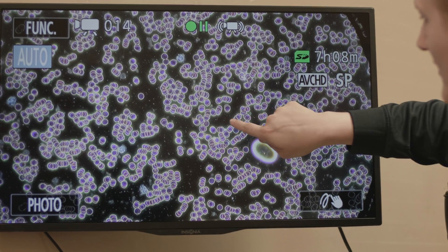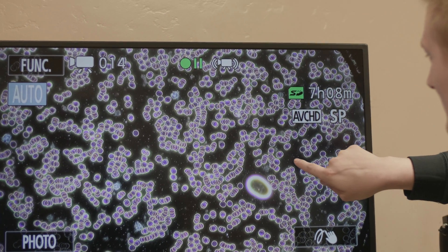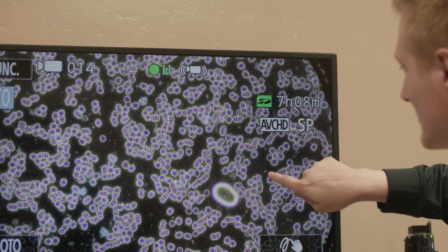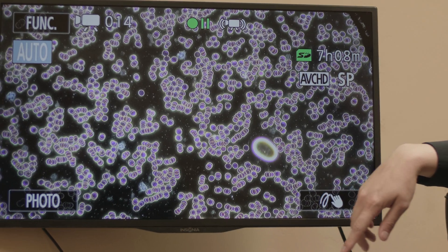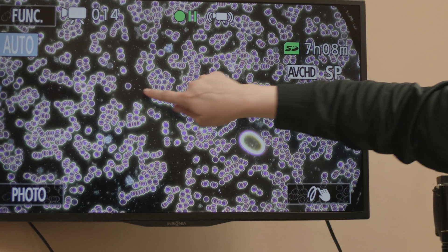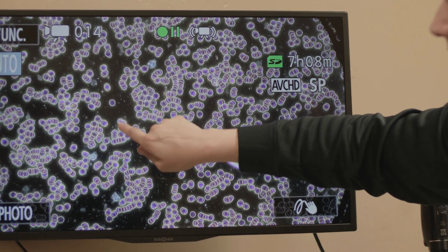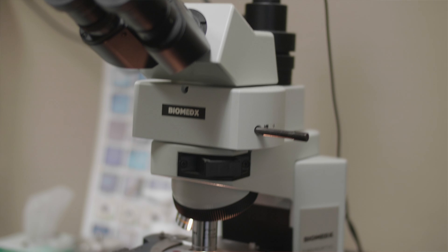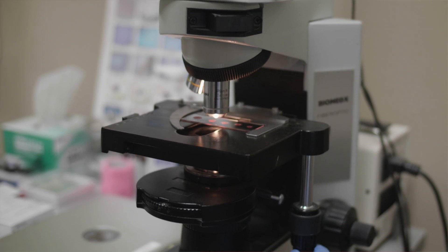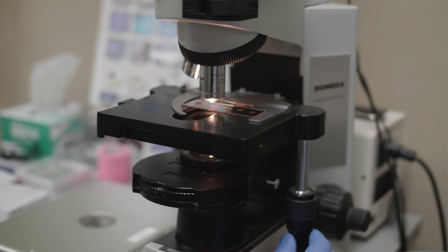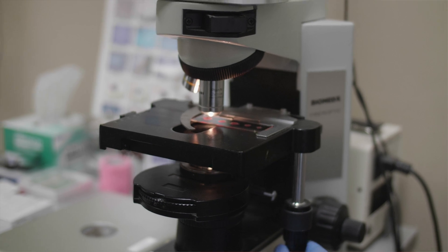The live blood acts as an educational feedback mechanism, where positive changes in the structure of cells can be viewed over time as improved nutrition impacts the blood. Nutritional microscopy, or live cell microscopy, can be combined with dried blood cell analysis.